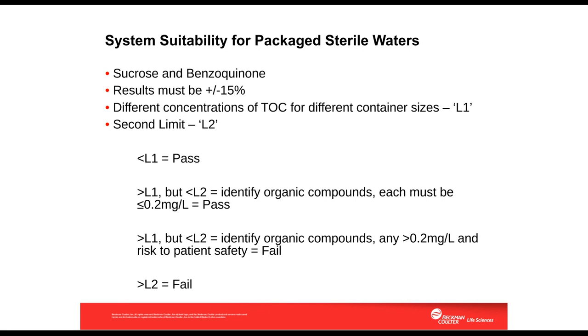Additionally, if the TOC analysis from the water sample shows that the level is higher than the second limit L2, then again, the sample does not pass the test and there's no requirement to identify and quantify individual organic compounds. However, of course, the user may require them to do this as part of their root cause investigation, but it's not mandated in the Pharmacopoeia.